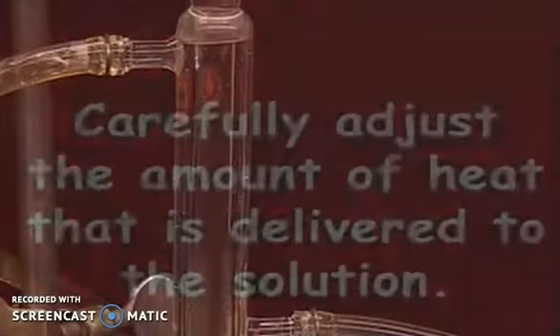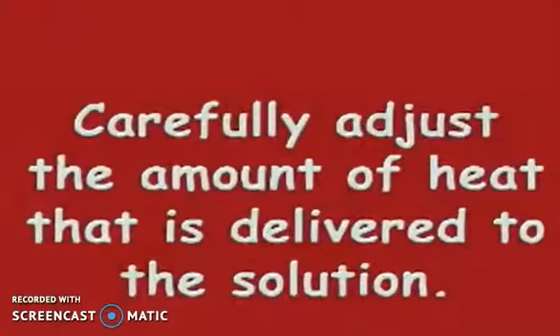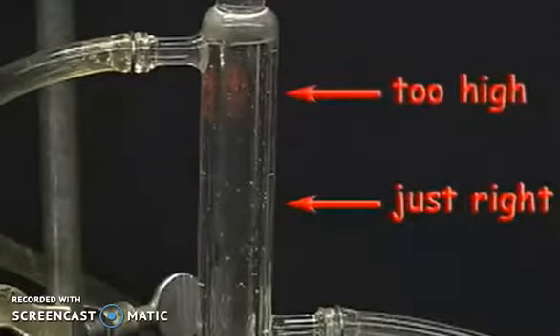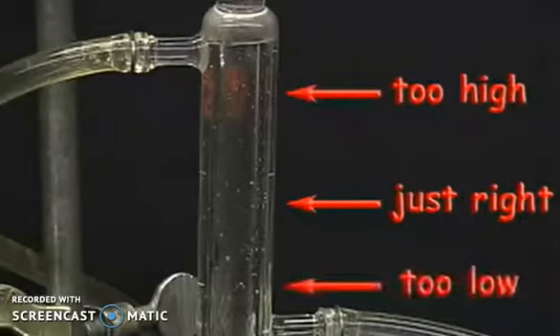Cool the condenser so the resulting liquid drops back into the flask. Carefully adjust the amount of heat delivered to the solution so the ring of condensation is about halfway up the condenser. You can see: too high, just right, too low.